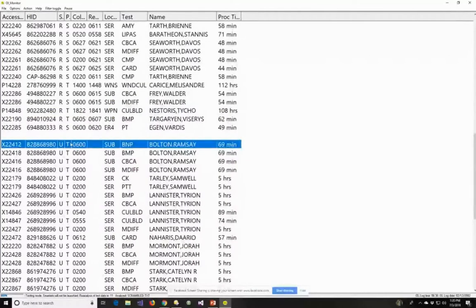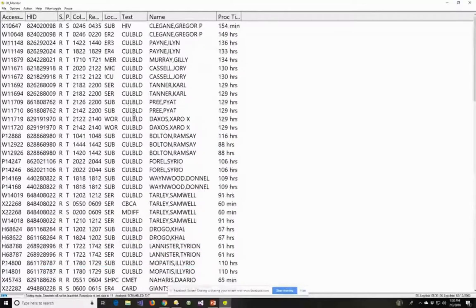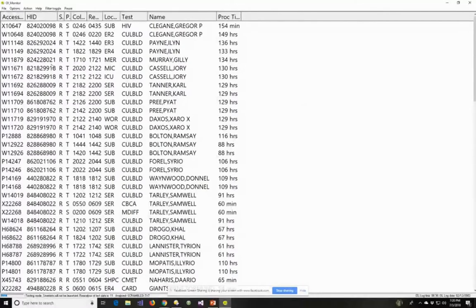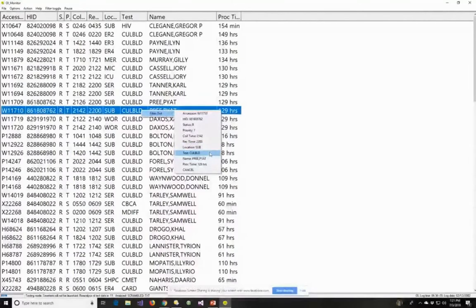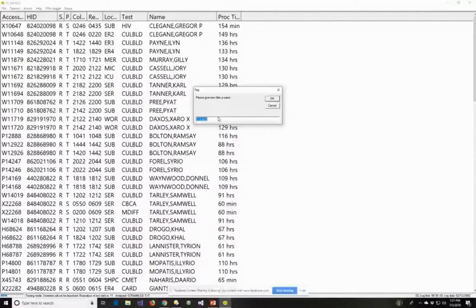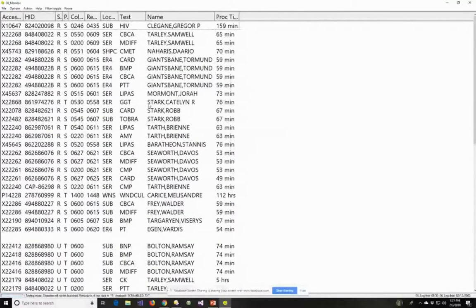The screen will automatically scroll down to the bottom of the list and then go back up again, so you get to see the whole list. Let's fix this list — we've got a lot of stuff we don't want to look at. Blood cultures — who cares? Let me show you how quickly you can filter to get rid of stuff you don't want to see. You just right-click and filter out. Test is culture blood. Just give it a name. Boom — now we've got rid of all those blood cultures and have our important tests.